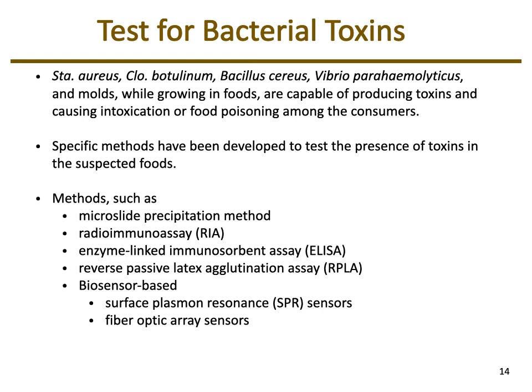There's a microslide precipitation method, which utilizes antibodies that recognize the toxin and clump them together, so you get this agglutination, similar to blood typing, or if in the micro lab you did the coagulase test. You end up getting clumps forming. If you have clumps forming, the antibodies agglutinated together because they were binding the antigen, and what they were binding was the toxin.